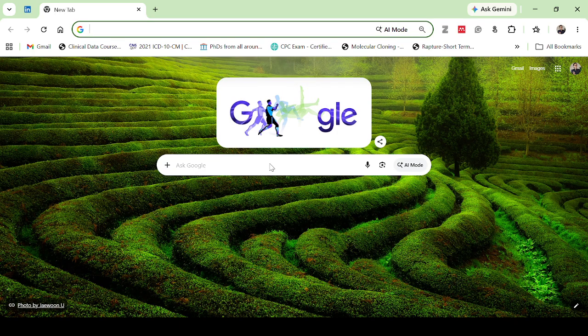Okay, let's begin with the basics. Before we proceed, what is SRA? It stands for Sequence Read Archive and it is the world's largest public repository of raw next generation sequencing data. Unlike databases such as nucleotide or protein, which store processed sequences, the SRA database stores the original sequencing reads generated directly by sequencing instruments, and these raw reads have not been assembled into a genome or fully analyzed. Researchers use them as the starting point for bioinformatics workflows.